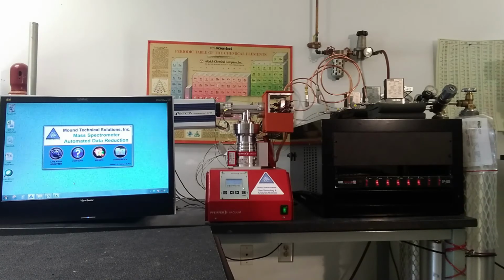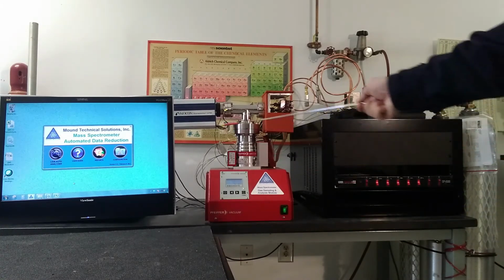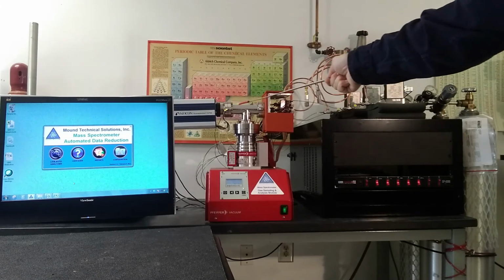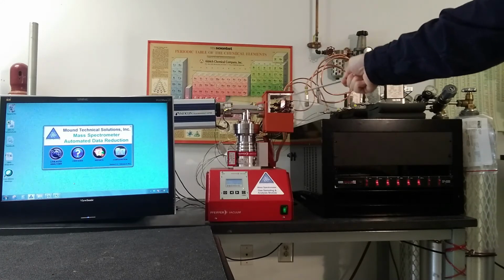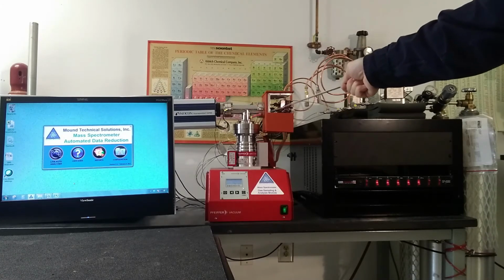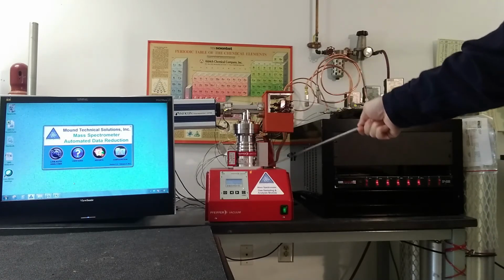Hello, welcome to Mound Technical Solutions. We're here in our lab today to demonstrate the quadrupole mass spec used to monitor inert atmosphere manufacturing cells, otherwise known as glove boxes. So what we have is our INFICON closed ion source quadrupole mass spec sensor inside of our sample chamber. The sample chamber is a T configuration mounted atop of our vacuum station.